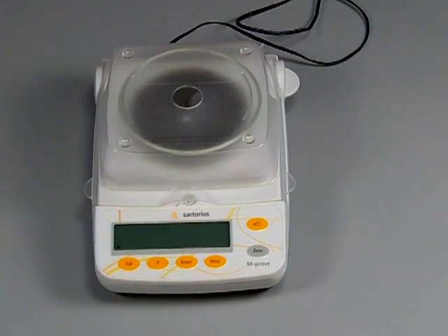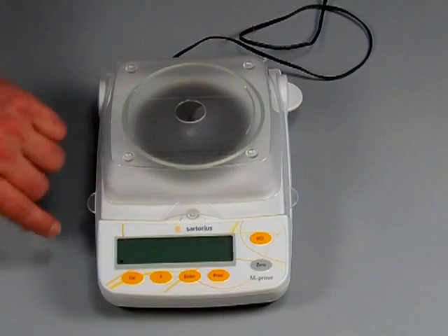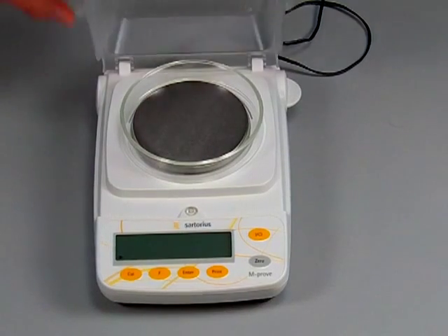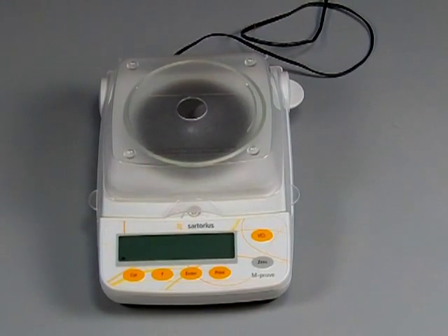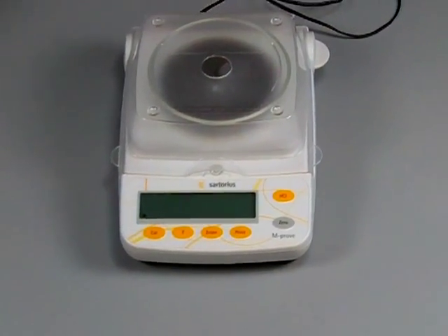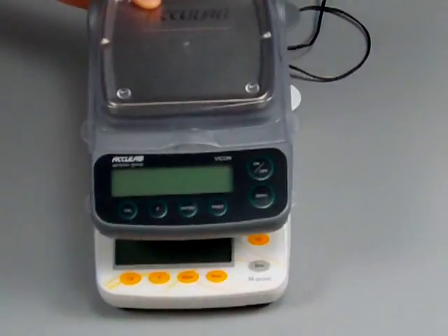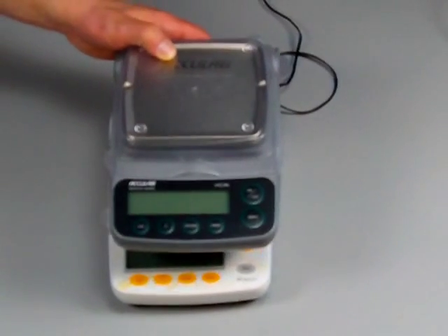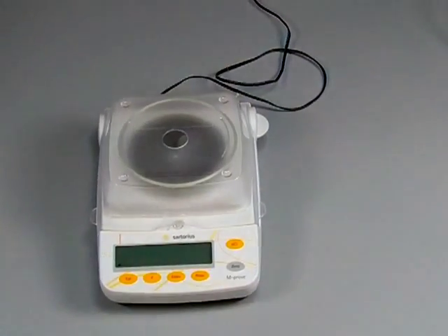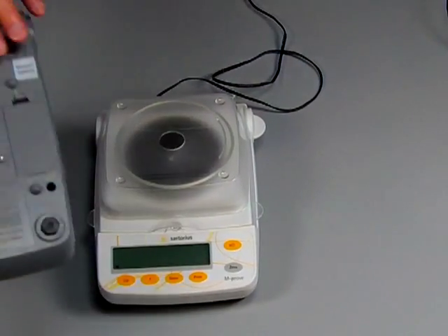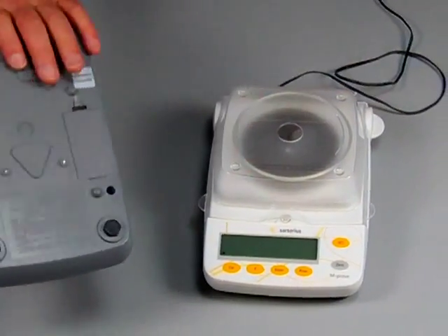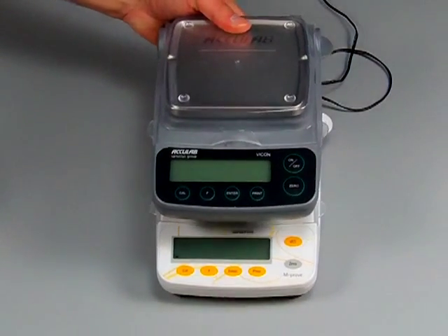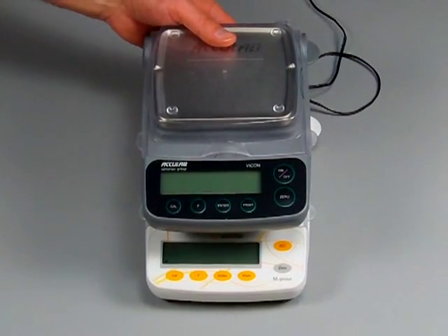The scale comes with this draft shield or protective cover. This cover is designed so that you can stack multiple scales together, like so. So if you were a school, you could stack multiple scales and you'll see these four little pads here go right into the cover. For a school that's looking to save space, that was their marketing idea there.